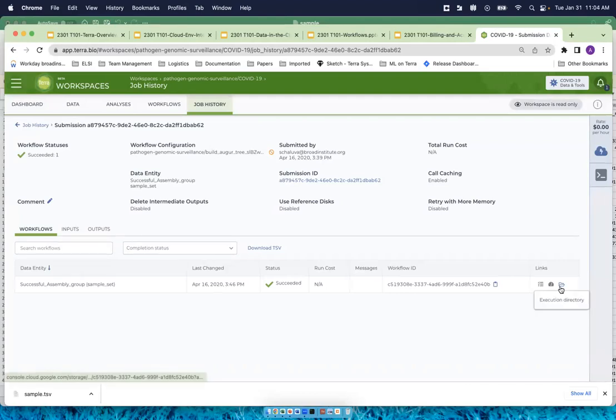This is particularly useful for troubleshooting. Like if you have a job failure, then you would go into that job and look through these links to find things like error messages or timing diagrams. And if that all sounds very daunting, the reason that's helpful is because we have a great support staff. When you want to find out why a certain workflow failed, you can just post on the forum, and they will most likely ask you to look up what the error message was or what the timing diagram said, and we will tell you what went wrong.